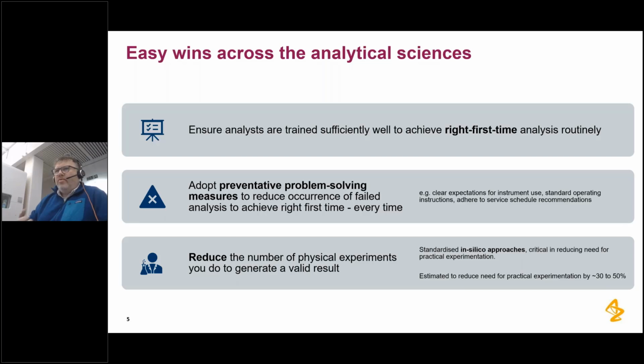And this is some of the areas that we've worked on over the last 3 to 5 years at AstraZeneca. So this is about driving the work that we do and getting to a right-first-time mentality so that we're not wastefully repeating experiments that have failed for reasons that could otherwise have been preventable. And where we are seeing a trend of analysis not being right first time, have we got structured problem solving measures in place to really allow us to understand what the root cause of that potential problem might be?